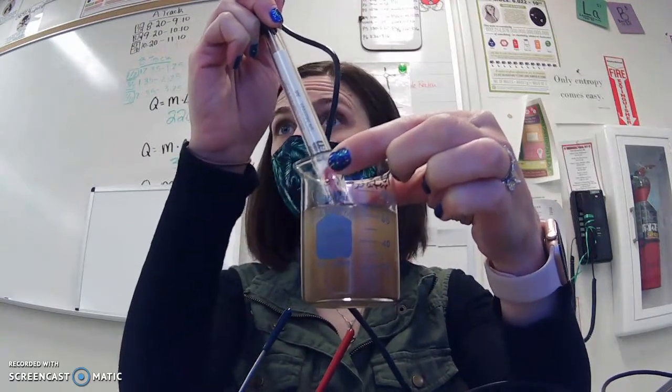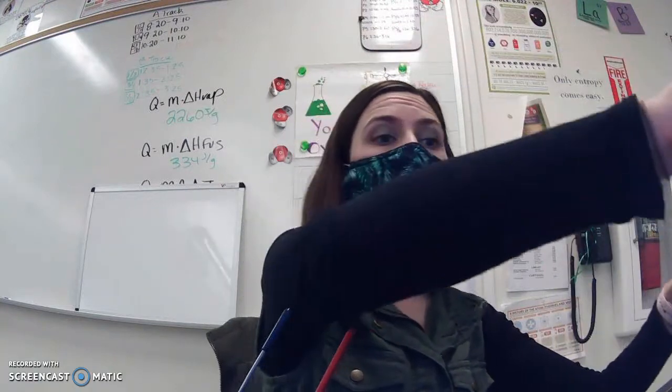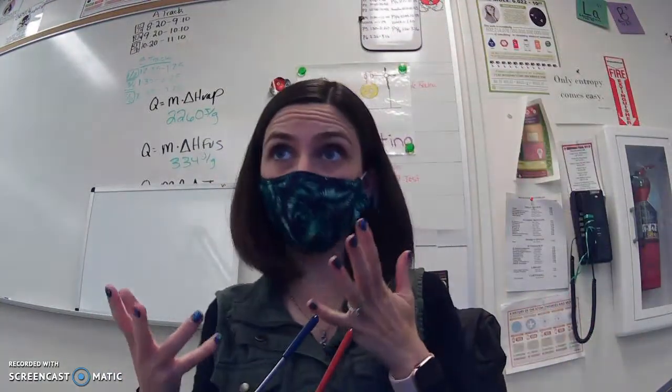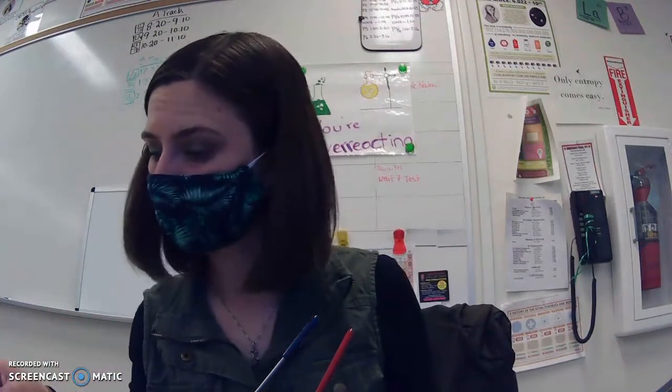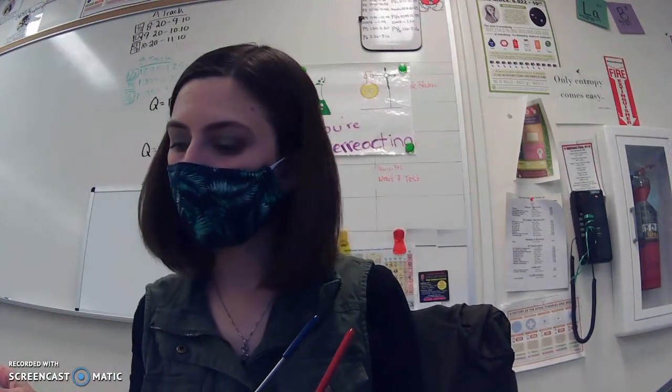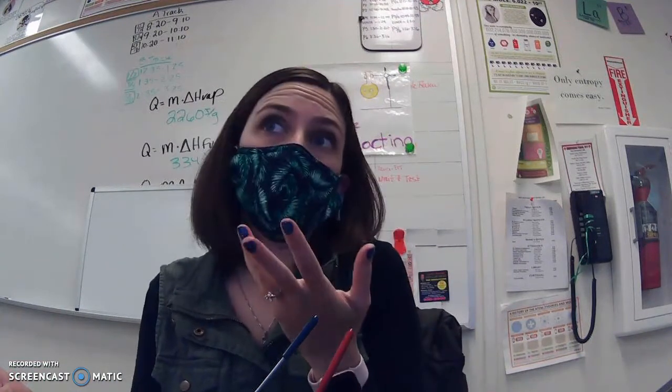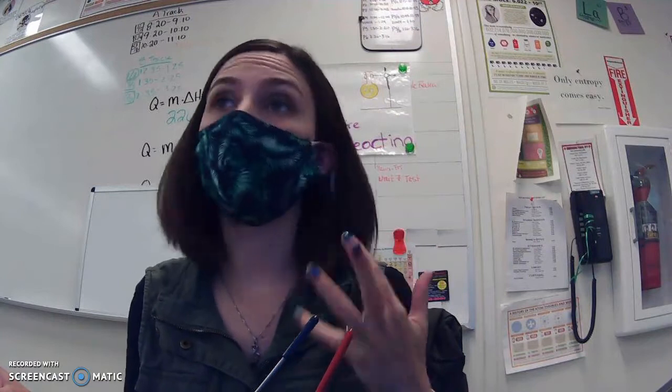So there are electrolytes present in our river water. Whereas you put it in just the DI water and it comes out to 0 again. So that one is saying that it has electrolytes, so it's lighting up. It's saying like 40, there's energy passing through it.